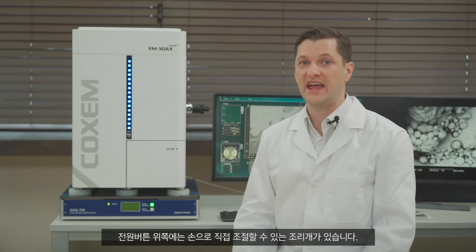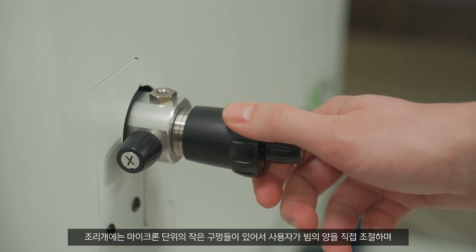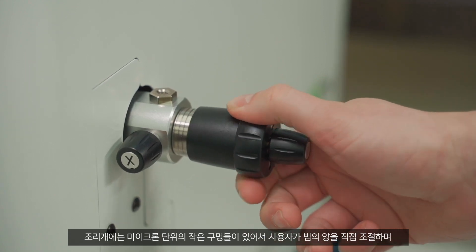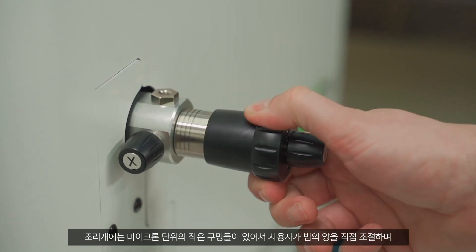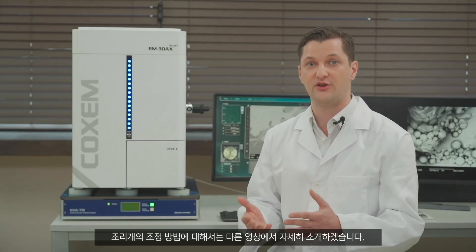Above the power button is an aperture that can be manually adjusted. Perforated with micron scale holes, the aperture can be used to directly adjust the size of the electron beam, helping an operator find optimal conditions for the observation of each specimen. Instructions on how to adjust the aperture will be provided in detail in another video clip.